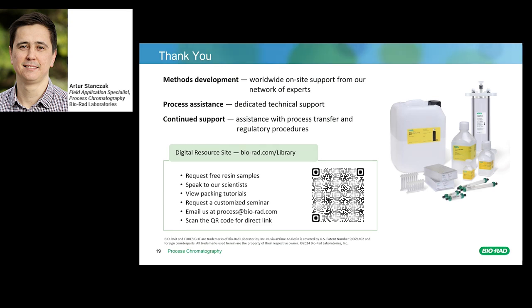All right, great. And as a reminder to our audience, you can go ahead and type in your questions for our speaker now. So our first question is, what binding capacity levels can we expect for AAV applications?